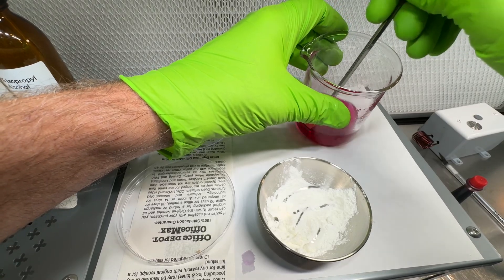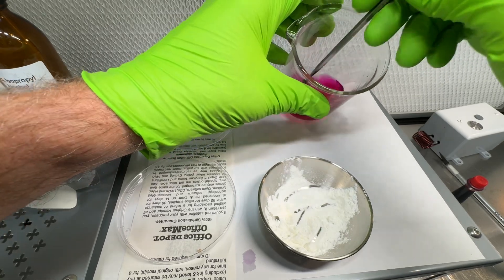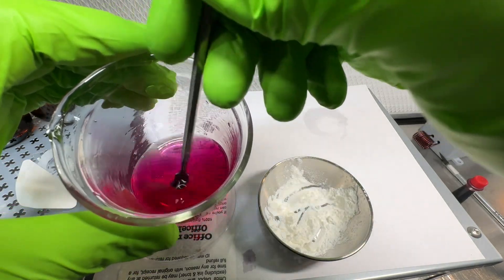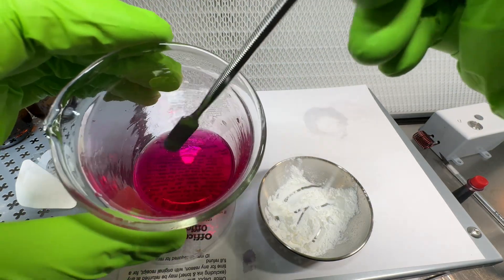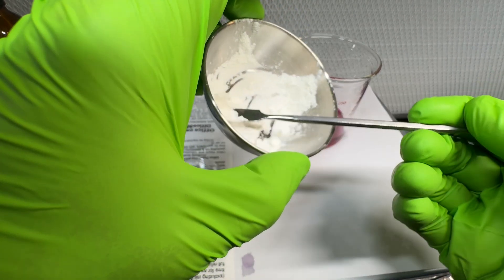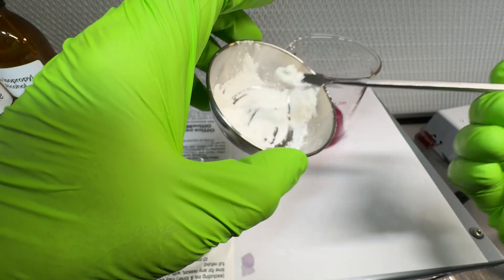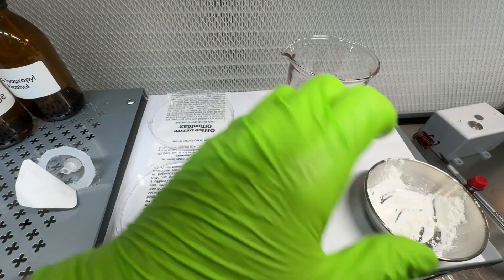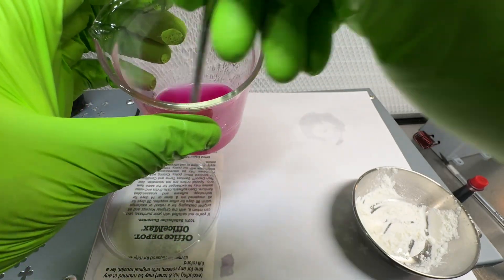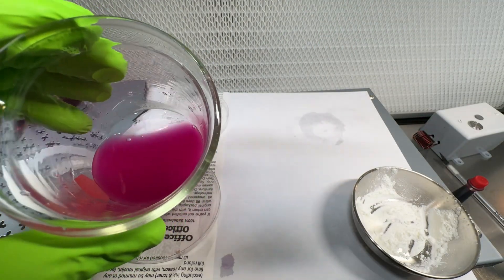We mix that and we end up with a pinkish-purple, very clear liquid — as you can see, you can see right through it to the print underneath. Now I'm going to add some cornstarch, which is going to act as our bacteria this time. After mixing, you can see it is totally opaque — you cannot see through it at all.